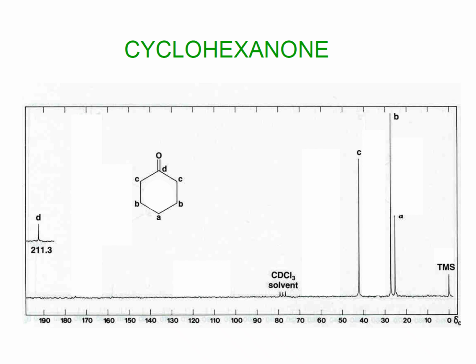So in the case of cyclohexanone, as you can see, it would be one environment, both of them would be another environment, one environment, another. So 4 peaks, but CO, C double bond O, means it will be around 200. So there would be one peak, and the rest of them would be around. Then C, as it is very close to the carbonyl, would be deshielded. Then the B would be here. Then the A would be here. And another one is TMS.